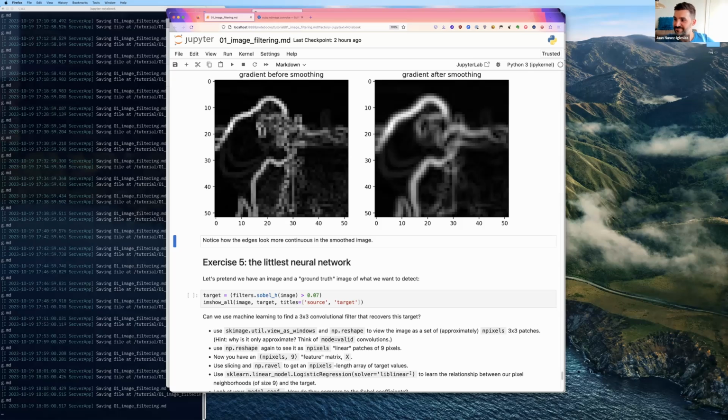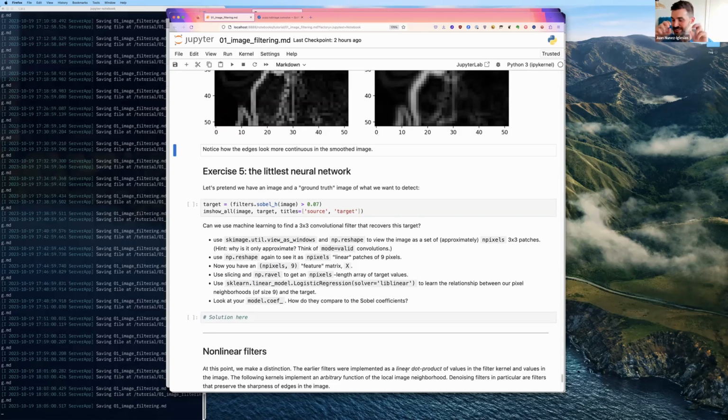And the smallest version of a neural network is a single neuron, which is called logistic regression. So all it's doing is it's doing the weights, multiplied by the position, and then it's got a little nonlinearity so that the output is between 0 and 1, or -1 and 1 rather.